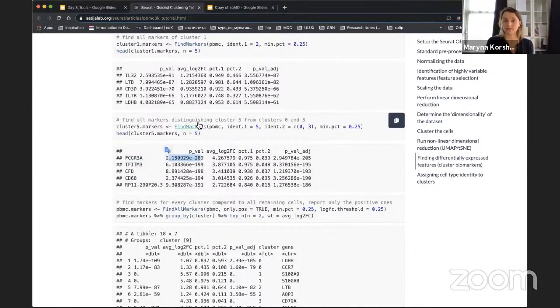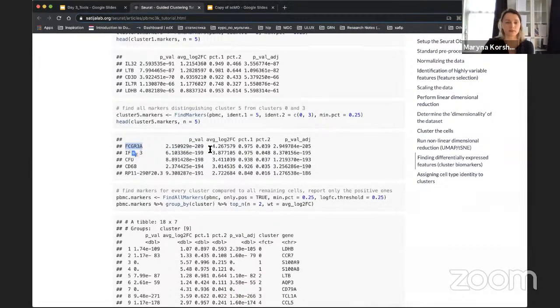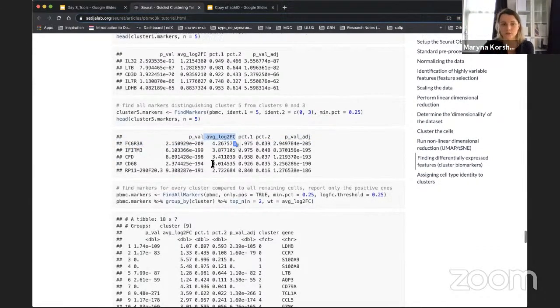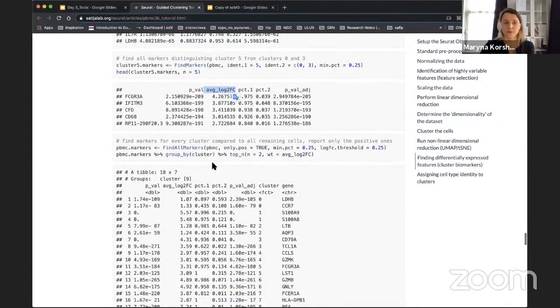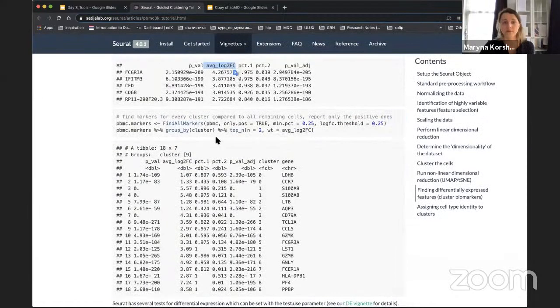But answering, or supplementing, Alexander's approach on how to understand if your gene is expressed in one cluster and not expressed in another, this parameter shows you these differences in gene expression. And while you are looking into this data, finding the markers of particular clusters, you should analyze it, and it's even easier to order the data and find these markers in the table.